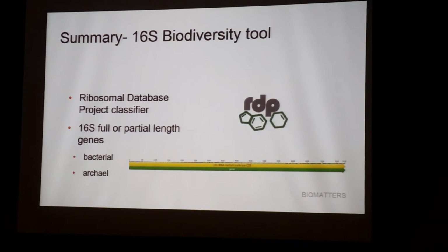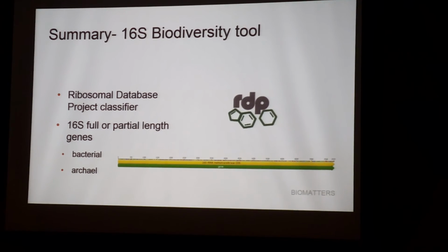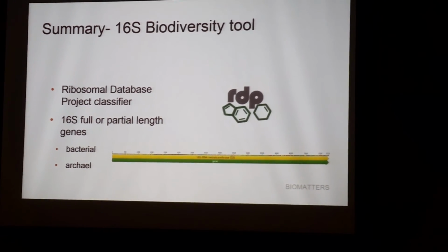So again, what I talked about was the RDP classifier project, using the full length 16S from the pre-processing, the analysis, and then reviewing the results.